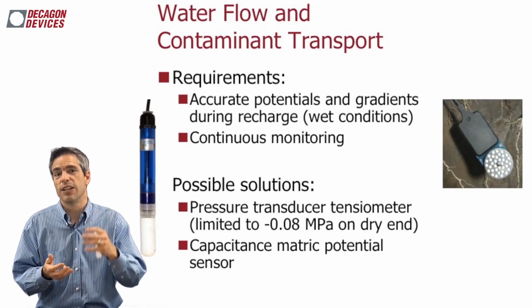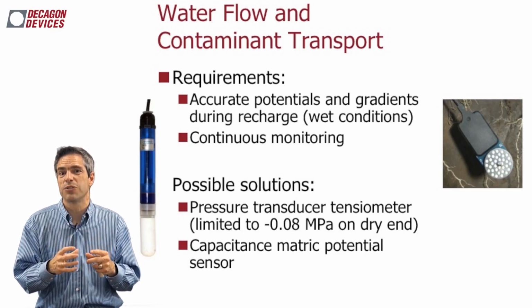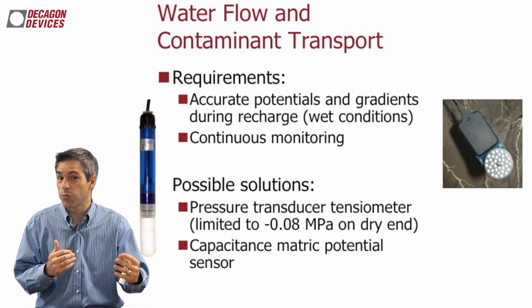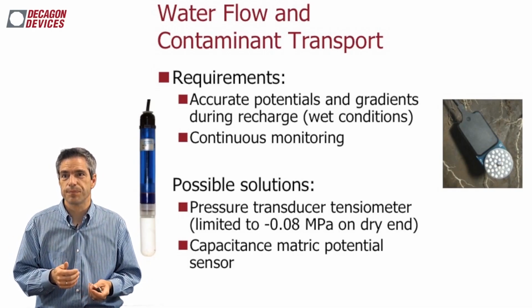Another possibility is a solid matrix equilibrium sensor. Got to remember though, most of these sensors do not operate very well close to saturation. That's where a lot of the flow is going to go. You're going to miss it in your analysis.